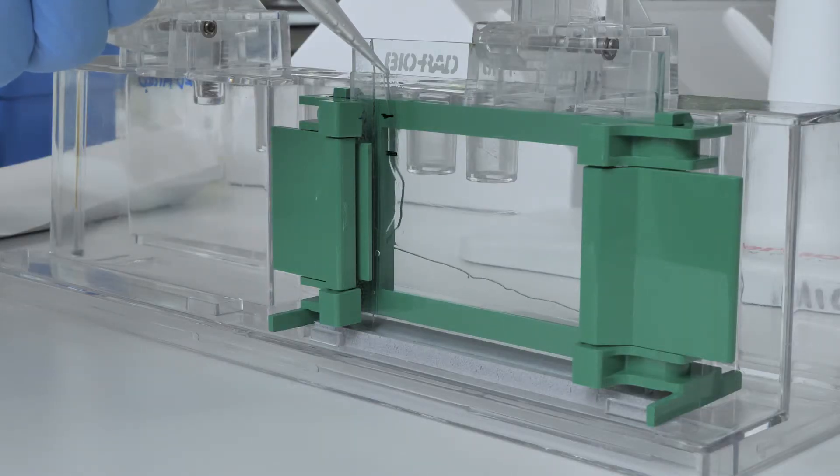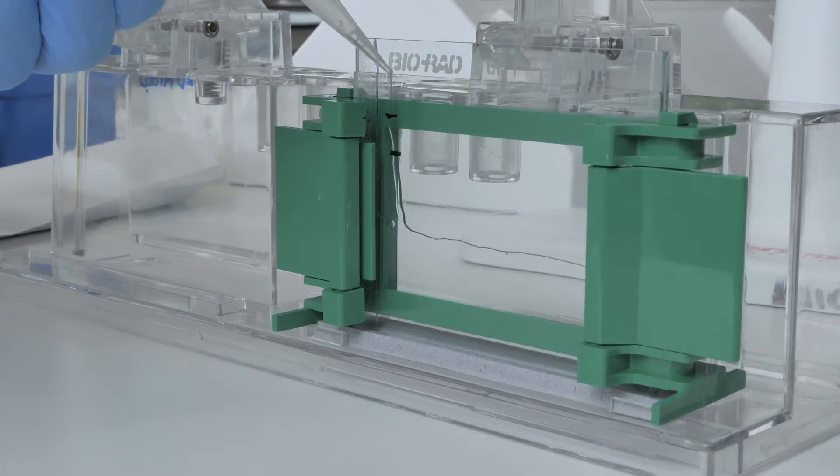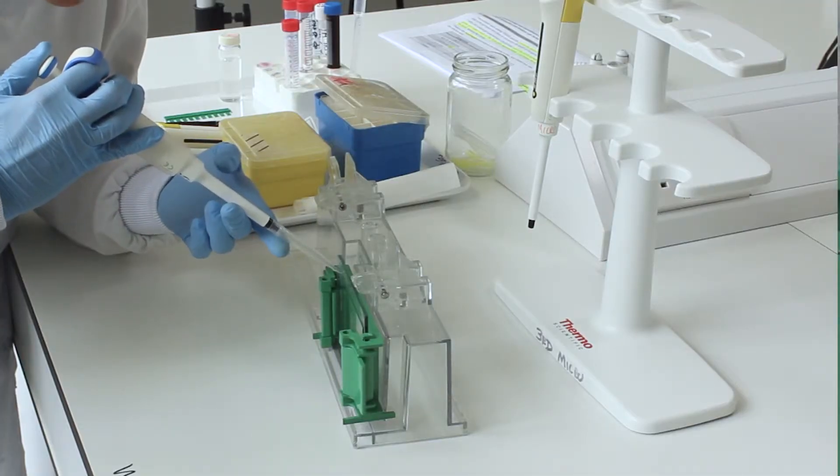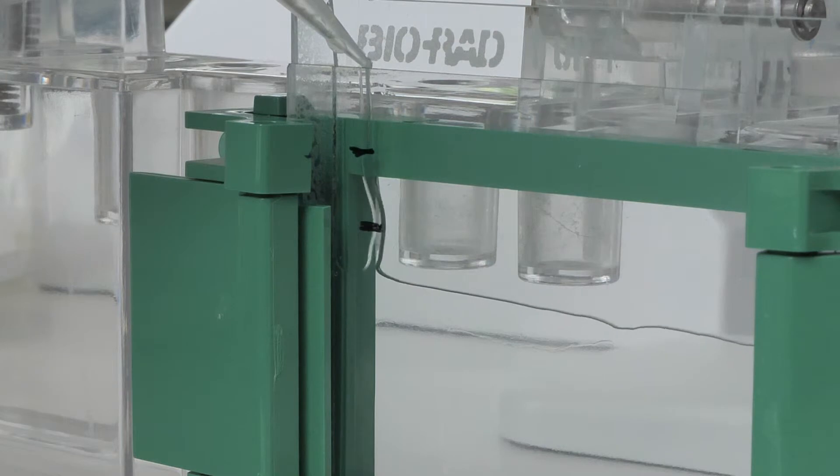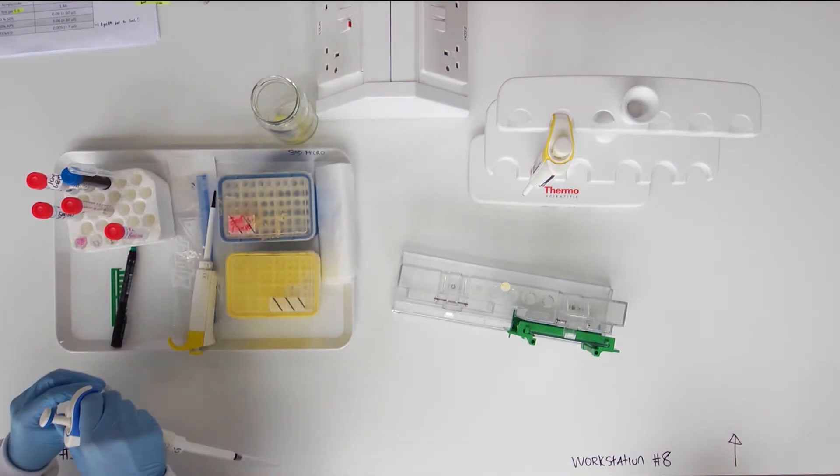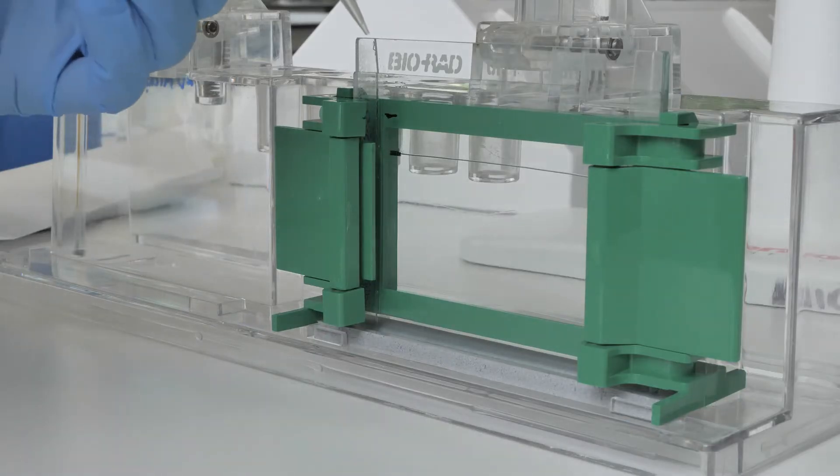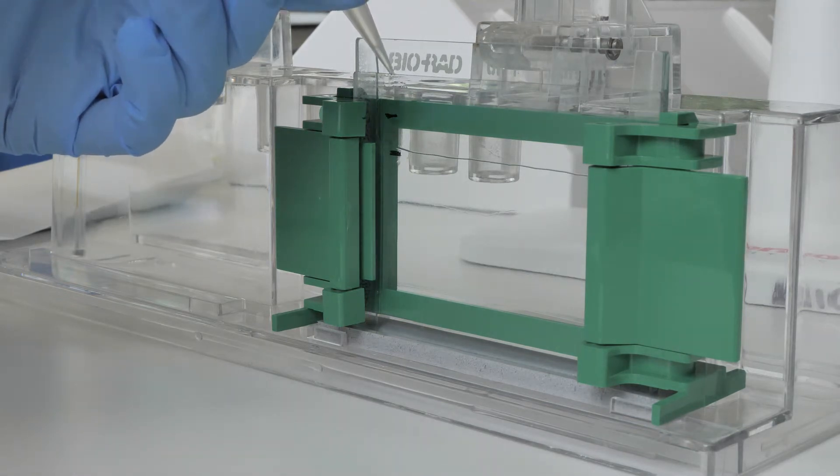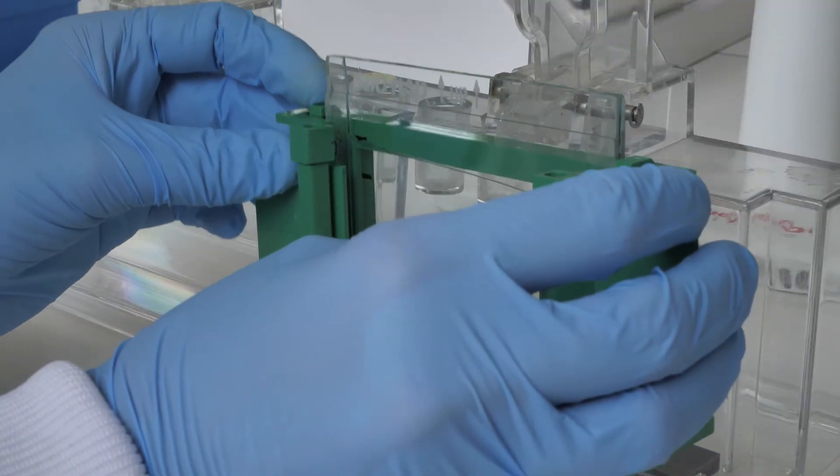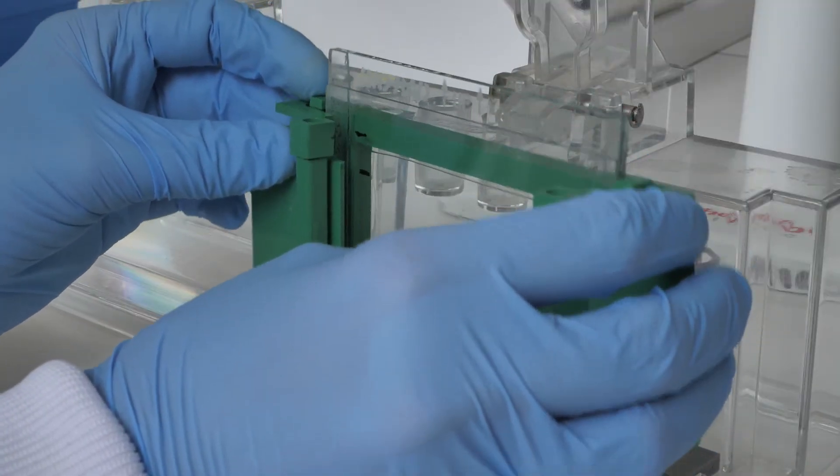Fill the gel sandwich using a 1 ml pipette until it reaches the mark you made on the plate. Pipette water very slowly down the side of the gel sandwich until it covers the gel surface. Rock the sandwich gently to eliminate bubbles and ensure a smooth surface interface between the resolving and stacking gels.